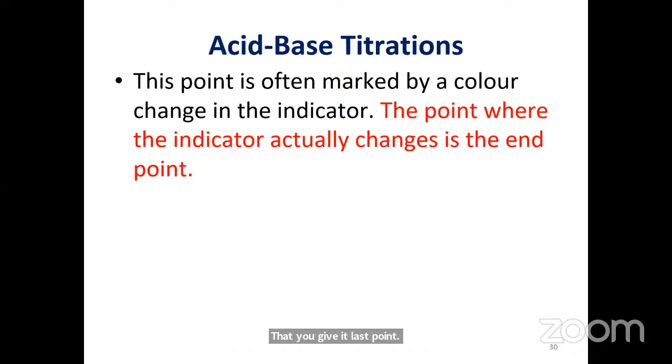You will notice that as you are adding the acid into the base, for instance, and you are using phenolphthalein, that color will be fading off. It will get to a point that the color seems almost colorless. When you get to that stage, you don't rush your acid into your base. It might just be a single drop of the acid that neutralizes the base, and then you have that color faded away.